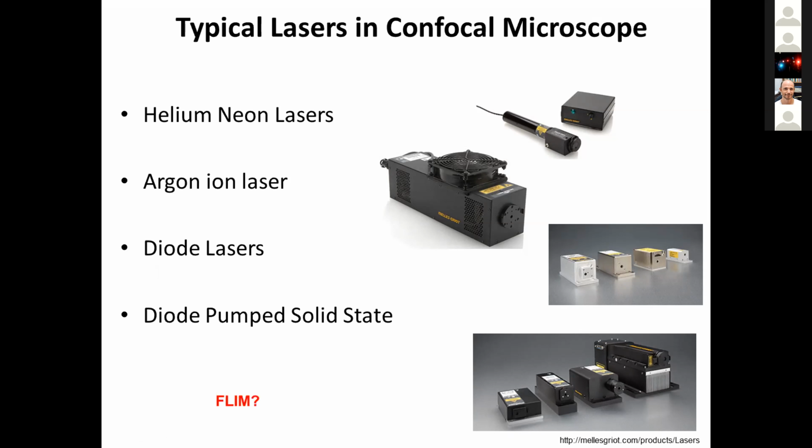And these are not able to be used for measuring fluorescence lifetime because we need a pulsed laser or modulated laser, which we can do with different approaches, like using an acousto-optic modulator, or some other alternative, Pockels cell, etc. But I will not go into detail on this characteristic.